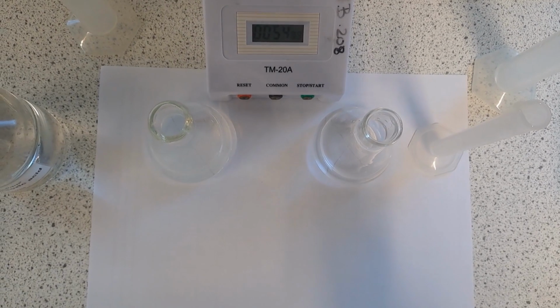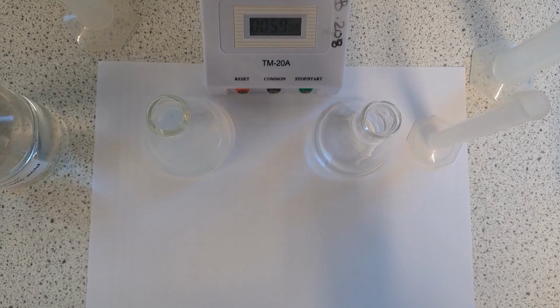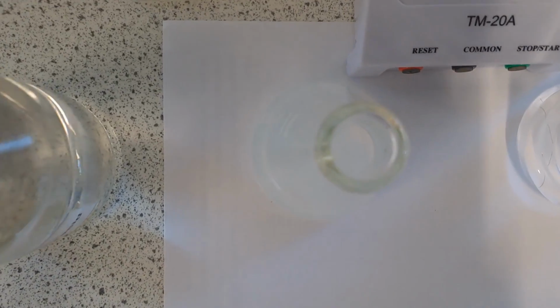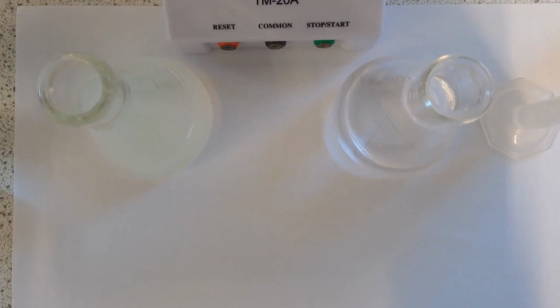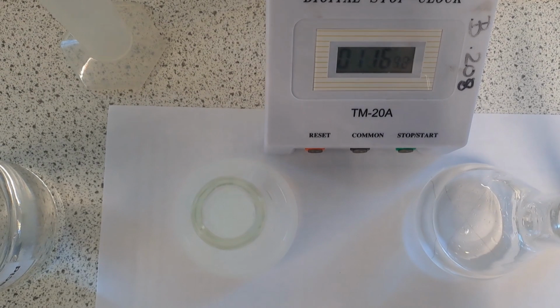So here you can see my left-hand one, my more concentrated solution, is starting to get cloudier and cloudier, and it's getting harder and harder to see that cross due to the turbidity, to the point where eventually I think it's about to disappear. But as we say, this is very much down to human judgment, and that's one of the errors that we're going to see in this experiment.